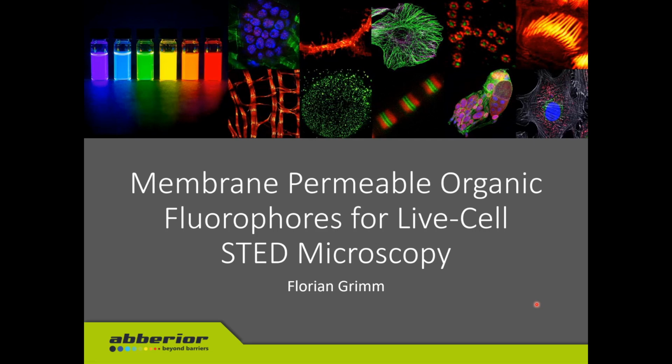Okay. Thank you, Janina, for your very kind introduction, and welcome everyone to my presentation, which is about the design of organic fluorophores suitable for live cell microscopy, for confocal microscopy as well as for STED microscopy. The main feature of these organic dyes is that they can easily pass the cell membrane, entering the cytoplasm of our living cell.